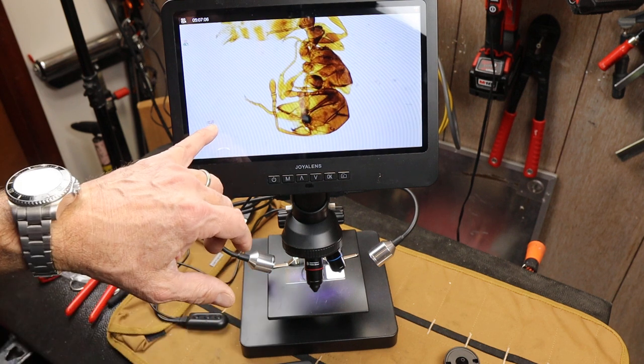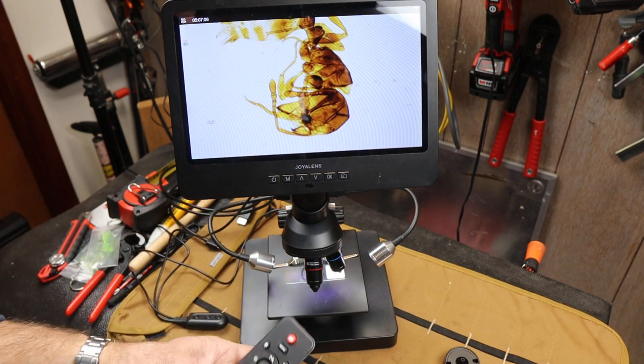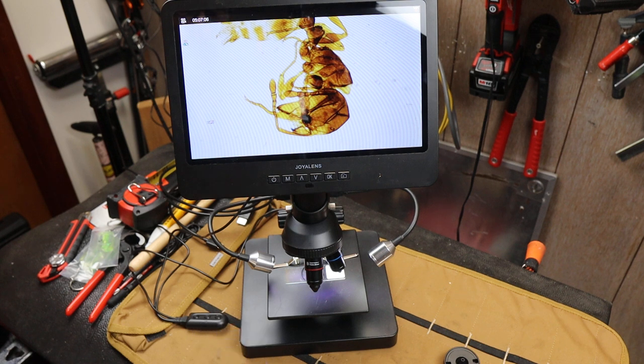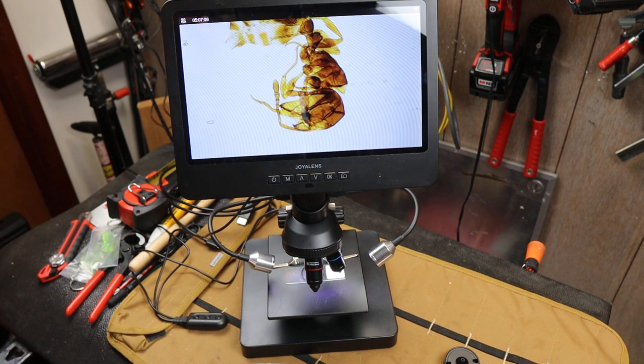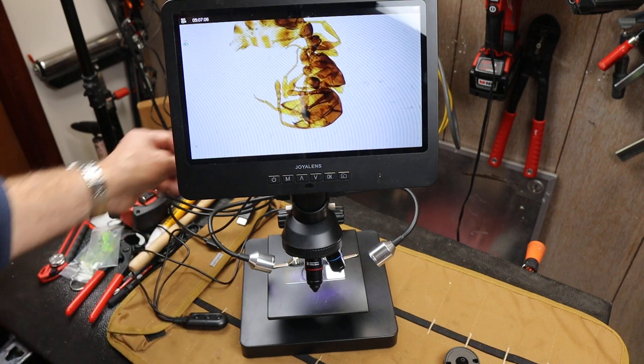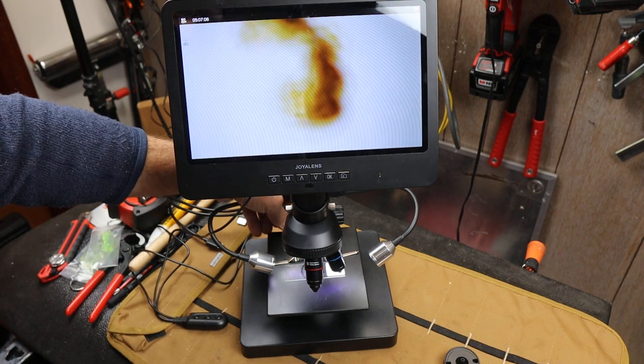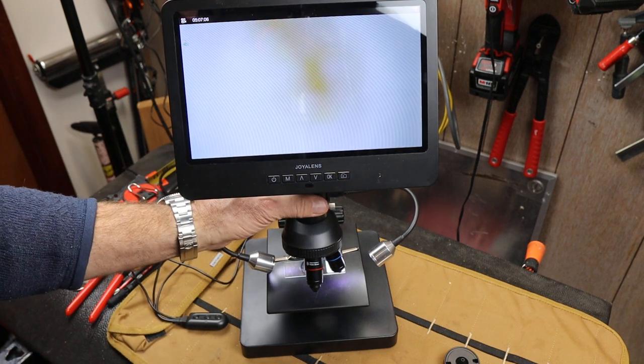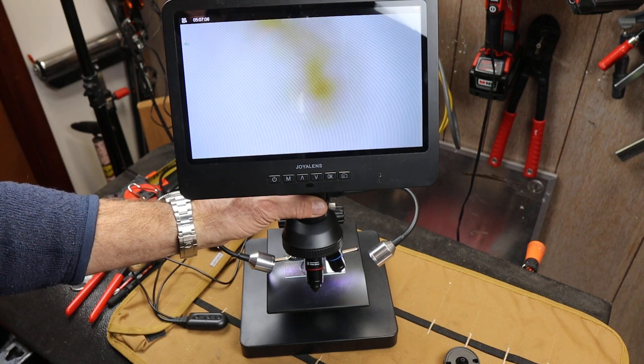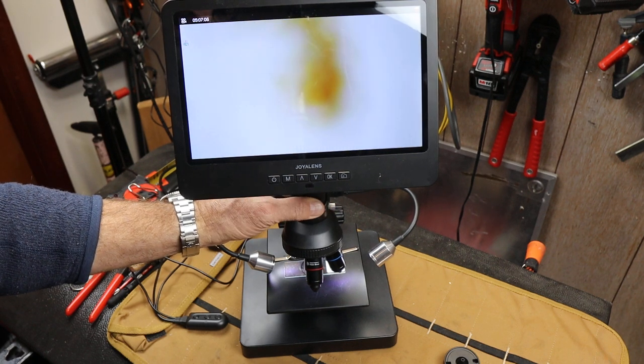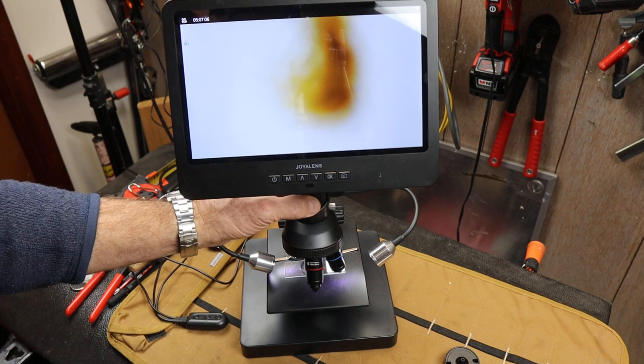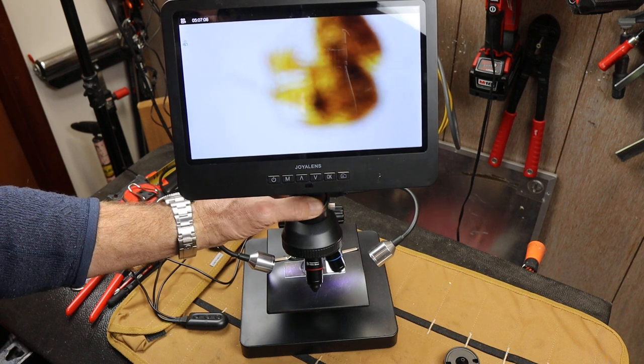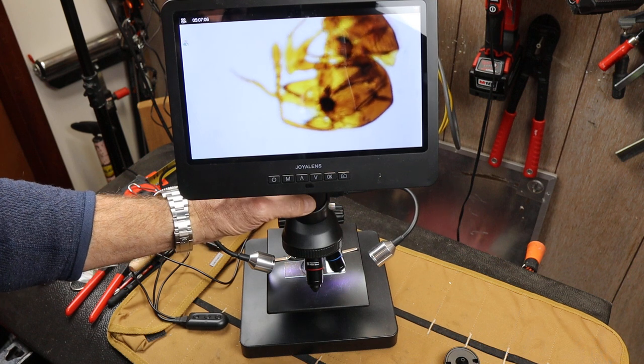Now I am at 1.6x, so I can back off and make this even sharper. I'll go down, there's 1x, but I can bring this up and then refocus here. Check that out.